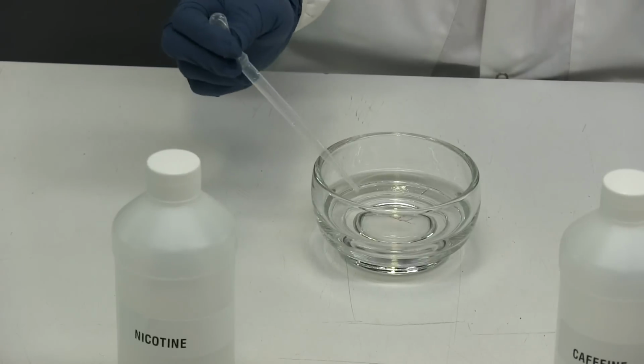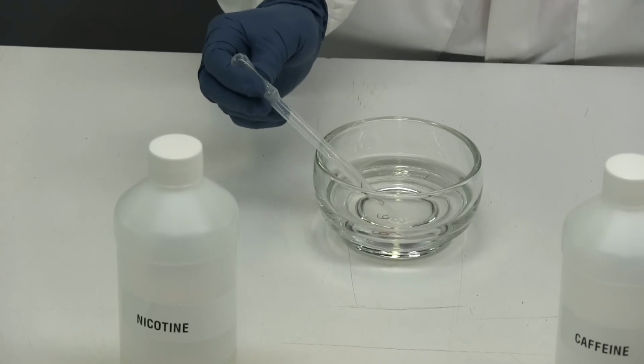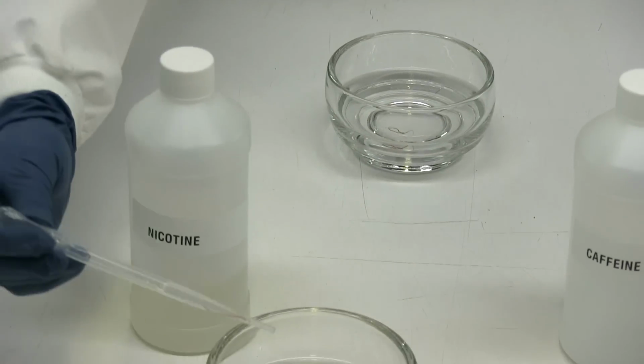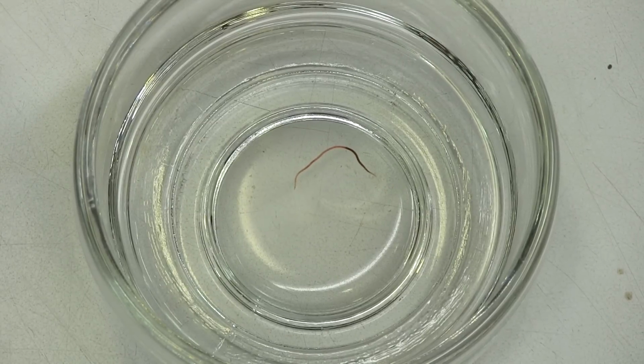The next step is to introduce the blackworms to a toxicant. The first one we're going to use is nicotine. Some observations you might see is that they are noticeably slower, appear disoriented, the tail may curl with loss of response, and paralysis may occur in higher concentrations.